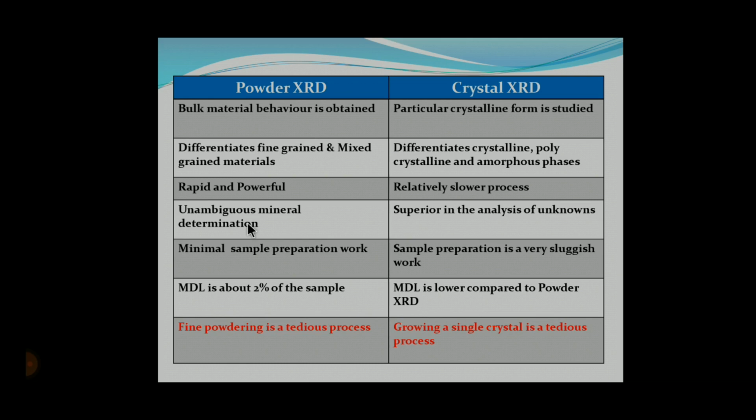At the same time, the crystal XRD is superior in the analysis of unknown materials. And in the case of powder XRD, we need only minimal sample preparation work. That means the material has to be finely powdered. Okay, the material has to be finely ground, and that powder can be used. So no particular or extra care is to be taken while grinding the material. The only care is that the heating of the powder should be controlled.